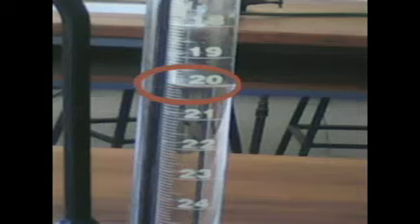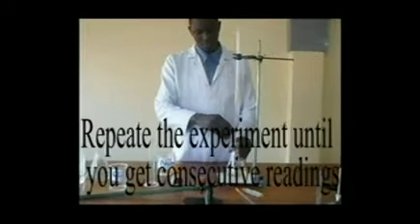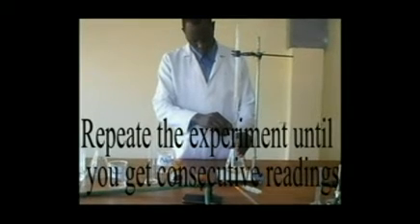The last drop causes the color to change from yellow to pink. Then mark the final reading from the burette. The final reading is 20.1. Repeat the same procedure to obtain more results.